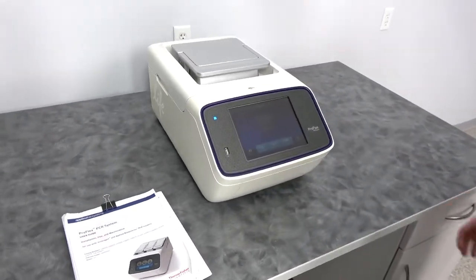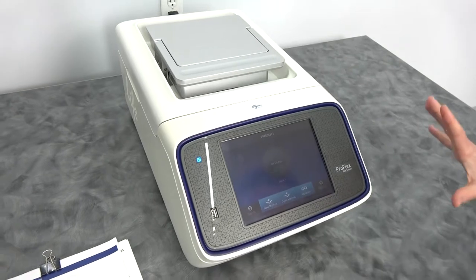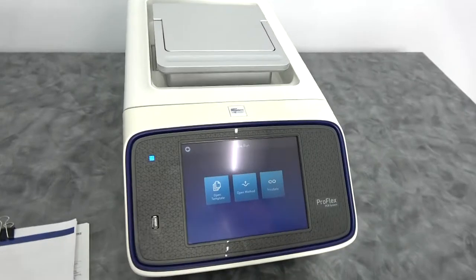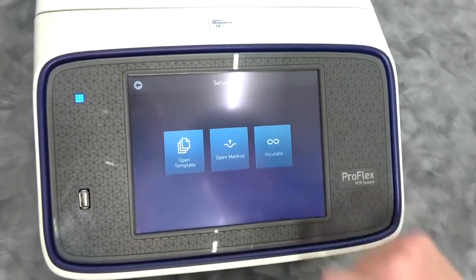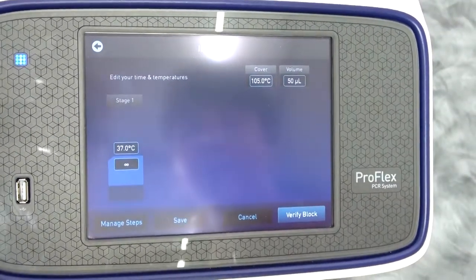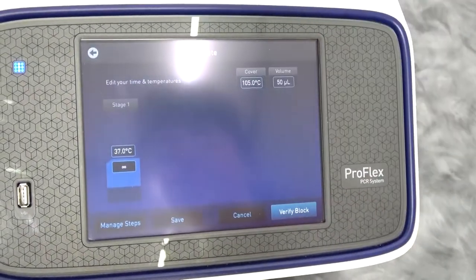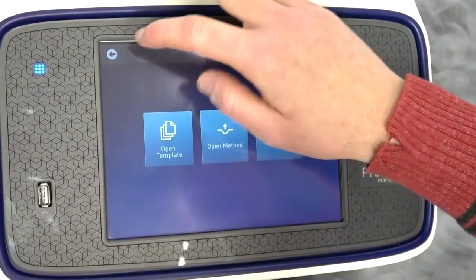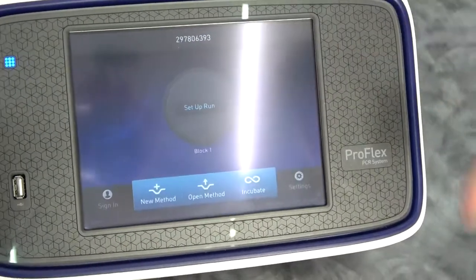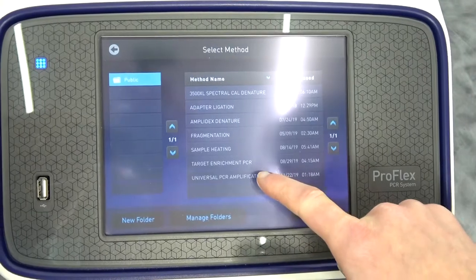I haven't used a ton of thermal cyclers, to be honest — this may be the first one I've had hands on — but I found this an incredibly easy to use instrument. You can click the center to set up a run, and you can open a method, open templates, or just do a raw incubation run and let it sit for a long time at whatever temperature you desire. You can open methods that are already installed, like a universal PCR amplification method.